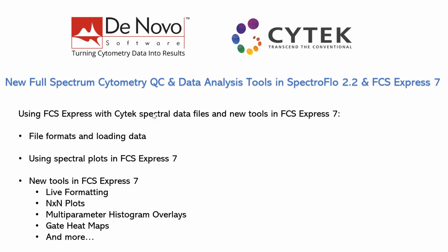So again, what we're going to be looking at in this portion of the webinar is using FCS Express 7 with Cytek spectral data files and some of the new tools in FCS Express. And we're going to be doing that in the context of the same data sets that Janelle had presented, Panel 1 and Panel 2, some of the multicolor versus single stain controls, as well as some of the other bead data sets that were shown.